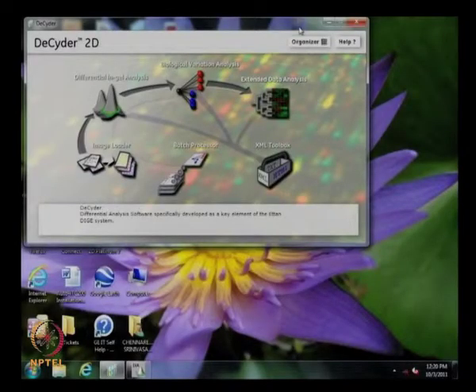Yes. So at the end, I would like to request you to give a brief overview of the DIGE software which is being used for analysis of DIGE gels. Sure. DeCyder is the software to analyze DIGE gels, where we can analyze DIGE gels in different stages.